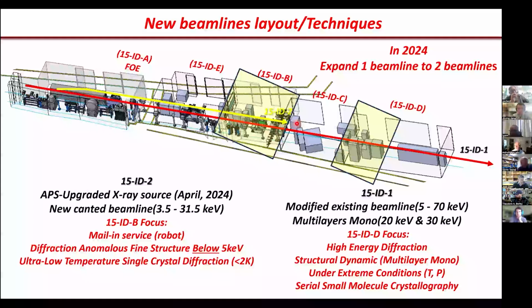It's hard to make a low temperature diamond anvil cell because everything connects to an adapter or something else. Some people were using open flow to cool down the diamond anvil cell, but you get a lot of ice. There are commercial systems for low temperature diamond cells. I think this DAC Tools company makes them. I didn't follow up. You can probably send me the link. Yes, I will. Okay.